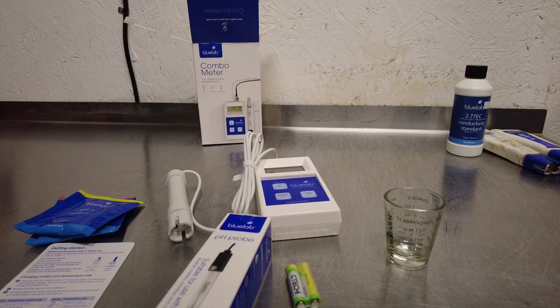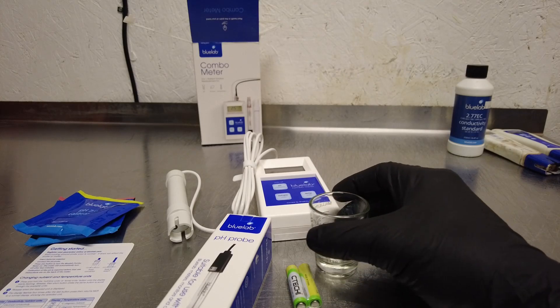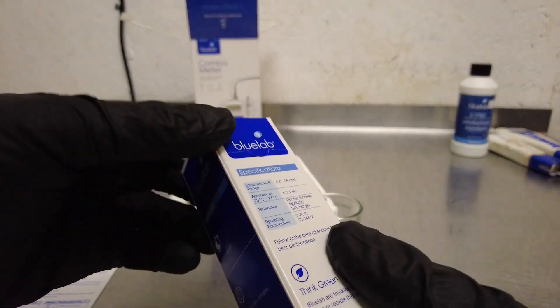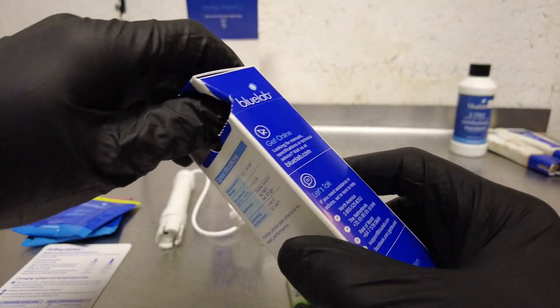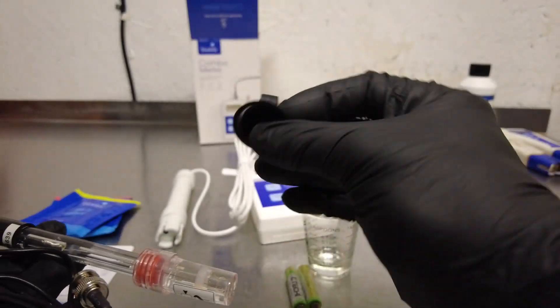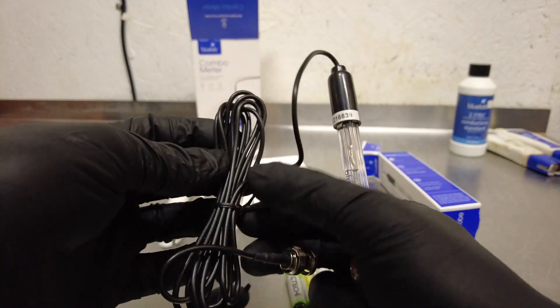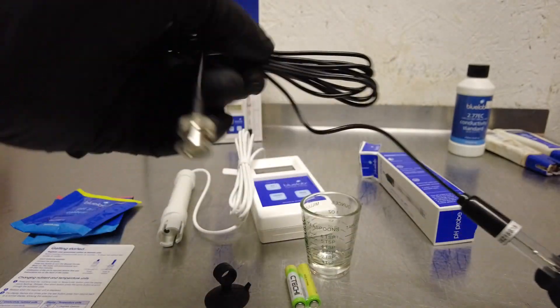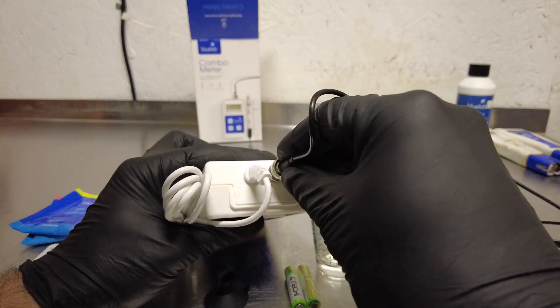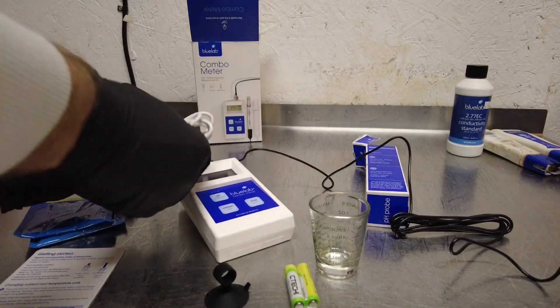I like to use these shot glasses or small measuring cups because they hold the pens pretty well. Let's pop open this pH probe and get that set up. It's pretty simple — just undo the twist tie, and it's a twist-and-lock mechanism. Match up the notches, push down, twist, and lock. That's it.